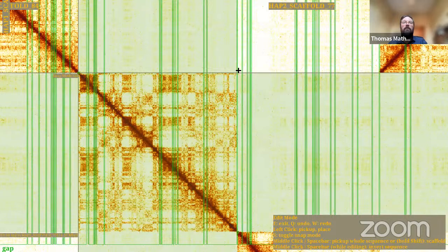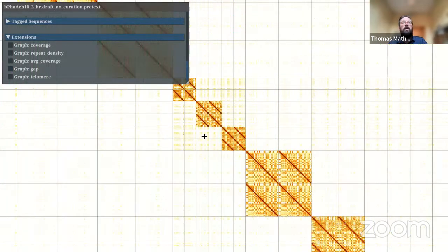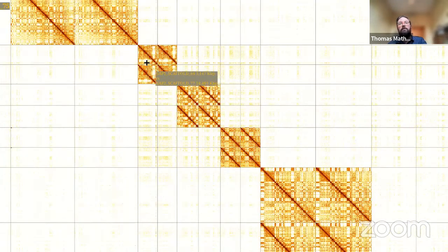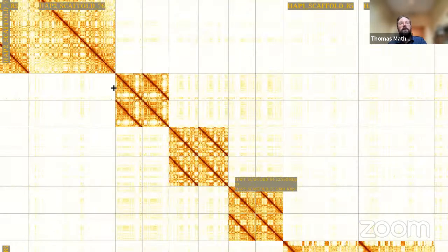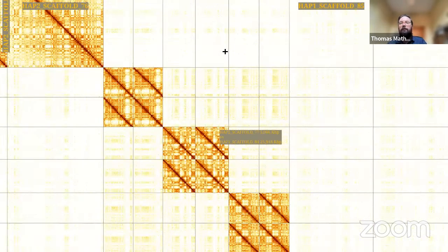Yeah. Pick it up, put it together, flip it. That one. So we're trying to build up the whole map really to find all the chromosomes, but we can flip this. So now we've got that one, what was joined as one is now three individual chromosomes with their two corresponding hap1 and hap2 sequences. Okay.